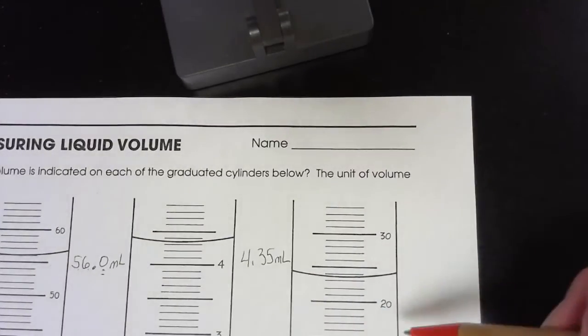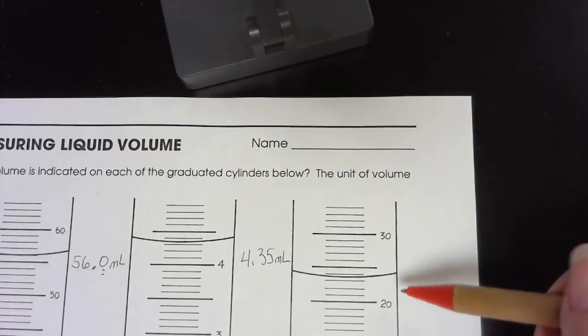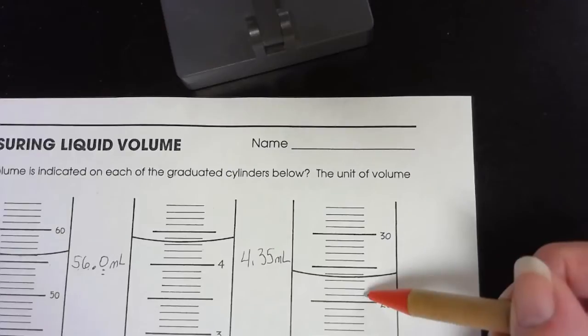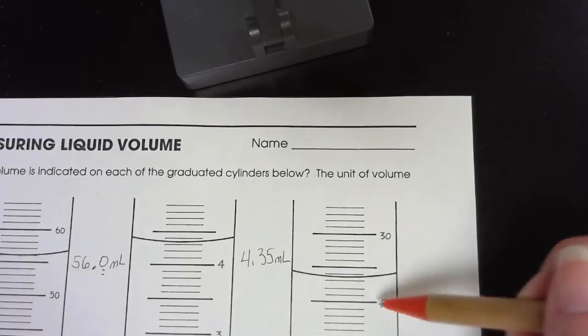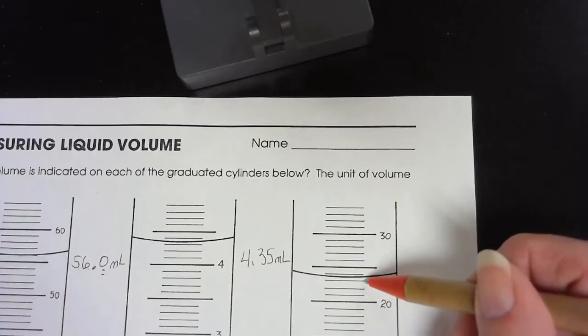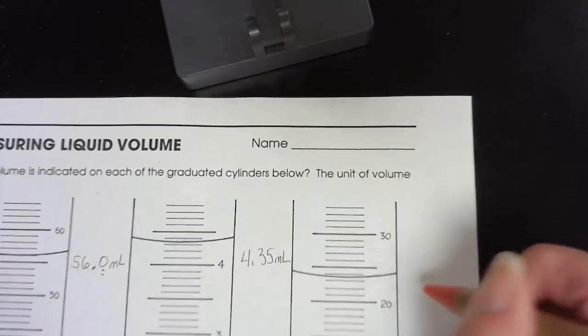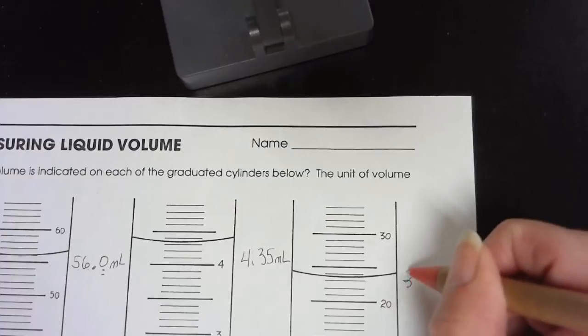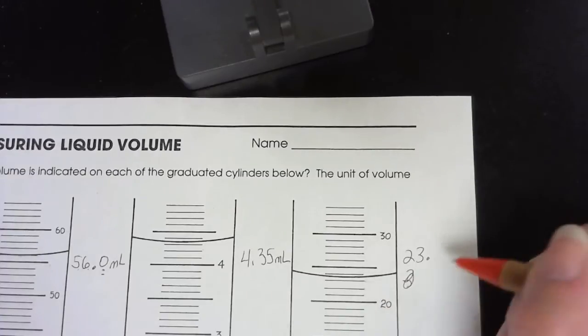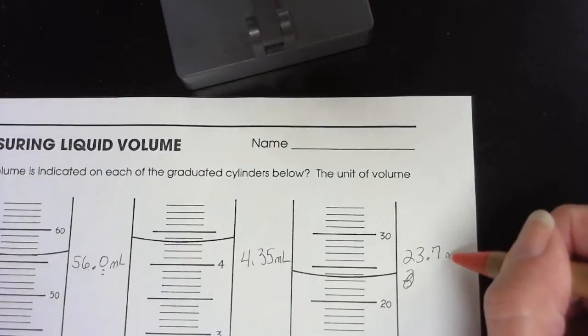Okay. Here I'm looking at a graduated cylinder that, between 20 and 30, so this would be 21, 2, 3, 4. These are in increments of 1. So 21, 22, 23. This is going to be 23, and it looks to me like it's a little bit more than 0.5. Hold on. 23. I'm going to say 0.7 milliliters.